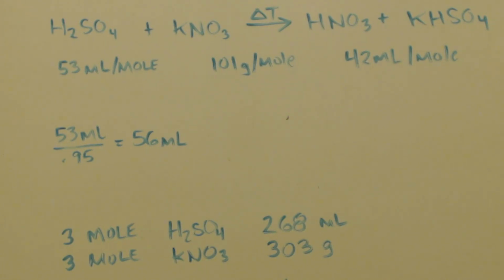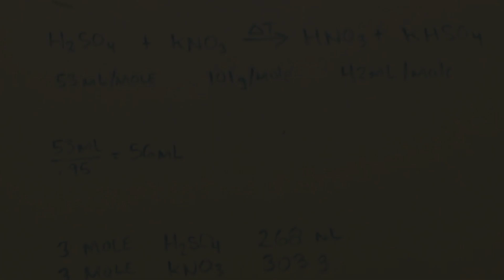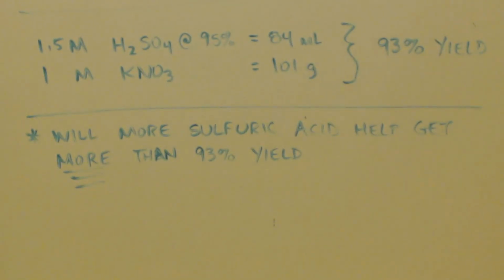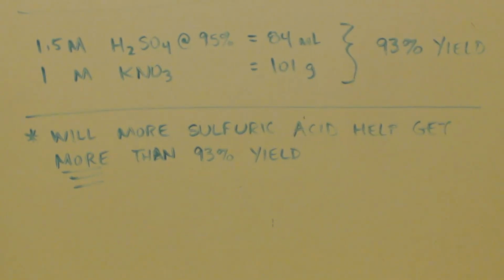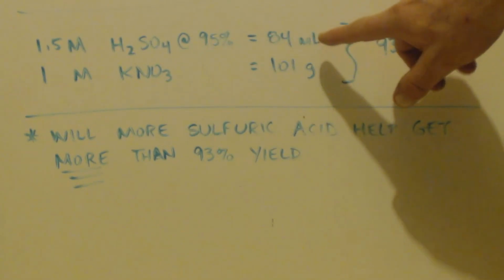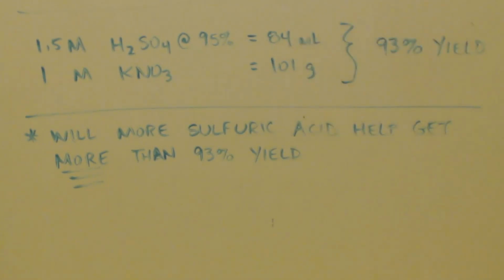Now in the first video where I only got 50%, I did a 1-to-1 ratio, okay? That only got me 50%. Now look at this new ratio. Now the new ratio that I do, and I get 93% pretty much every time. Instead of a 1-to-1 ratio, I'm using a 1.5-to-1 ratio. So instead of every 101 grams of potassium nitrate, instead of adding 56 milliliters of sulfuric acid, I add 84 milliliters. And that makes all the difference to double your yield almost. Because I used to get 50, now 93. That's almost double.